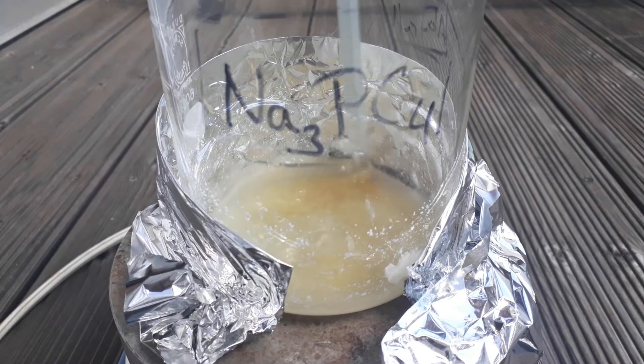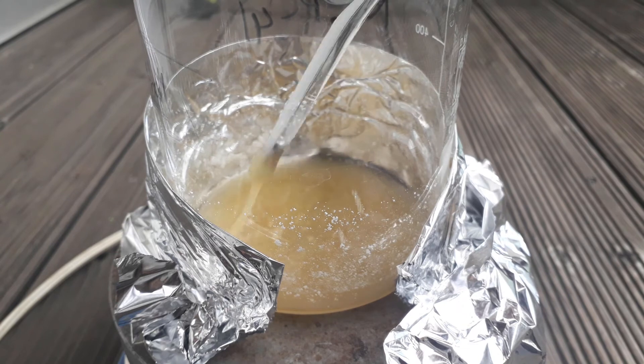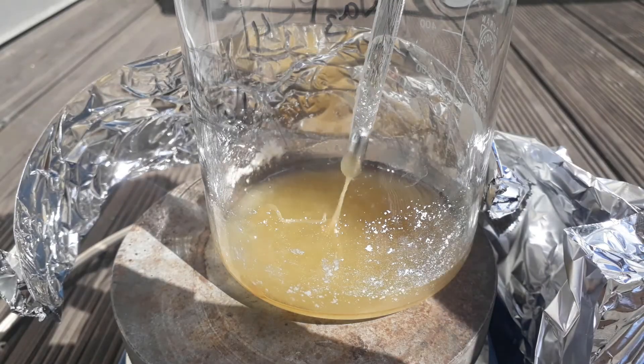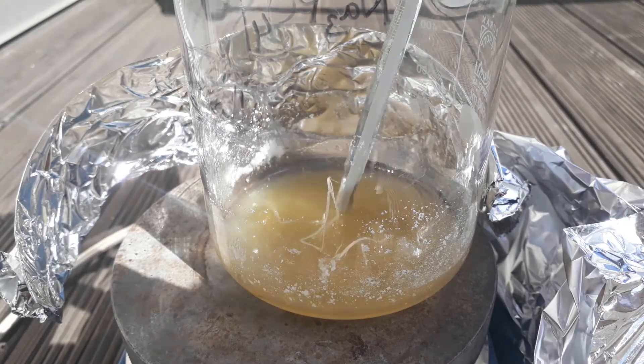After all bubbling ceased, I was left with this brown liquid, which on cooling turned very caramel-like in texture. You can see how I could easily pull out small strings of this material once it cools to room temperature completely.